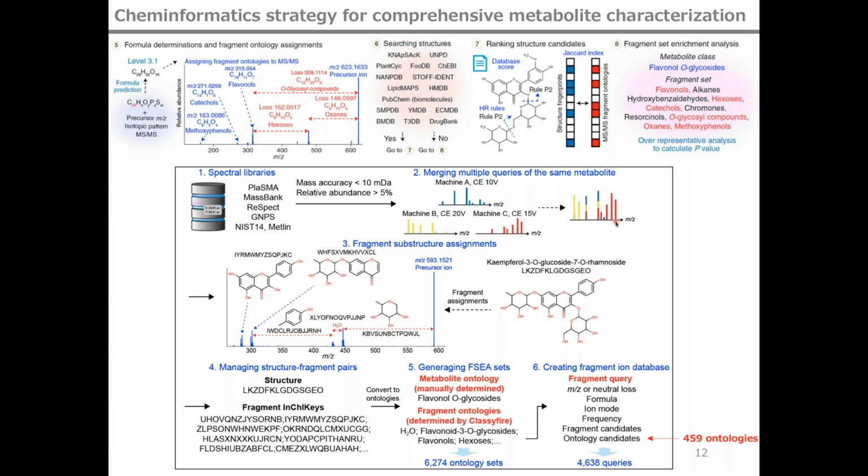The ion intensities are simply assumed because they were not used in this study. Here we could get this kind of structured and MS/MS spectrum pair. And we used the MS-FINDER program to assign the substructure formula to each product ion and neutral loss.